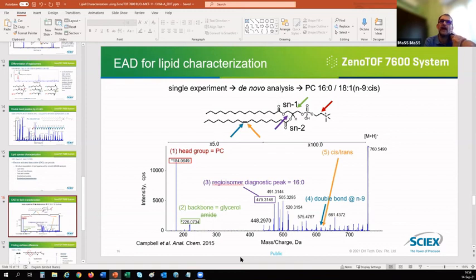I'm wondering how you plan or how you already integrate all this information in the identification power. How does your software work? Is it working with, I don't know, ion libraries where you've got all this information available and you assign a match? How do you actually use all the information that you can generate?